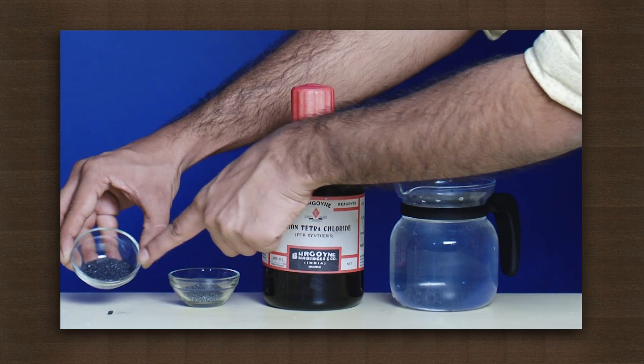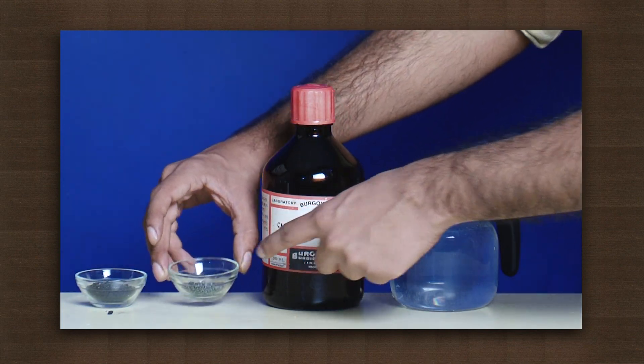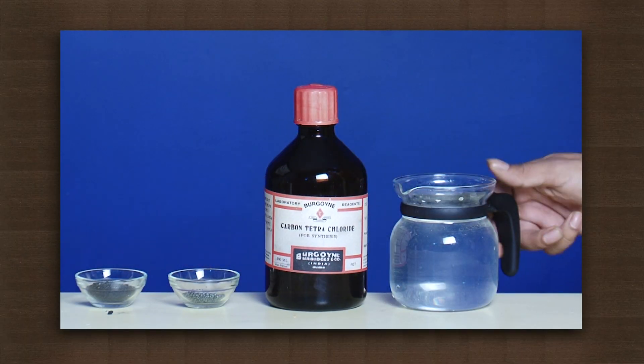Here we have potassium permanganate crystals, iodine crystals, carbon tetrachloride solution, and water.